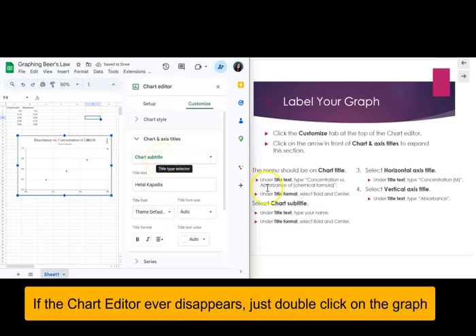And then we're going to go to horizontal title. And our horizontal title is going to be our x-axis. So on our x-axis, we are plotting concentration. And then we always want to include units because currently it just says 0.0, 0.2, 0.4, and 0.6, but I don't know what those numbers mean. When I put this M here in parentheses, that's telling whoever's looking at our graph that we are looking at concentration values in molarity. So that 0.2 is 0.2 molar, 0.4 molar, 0.6 molar. So it's telling us what is our molarity.